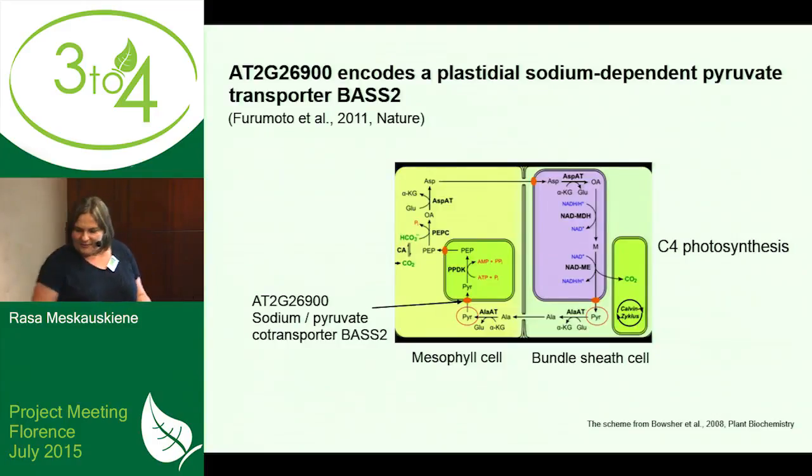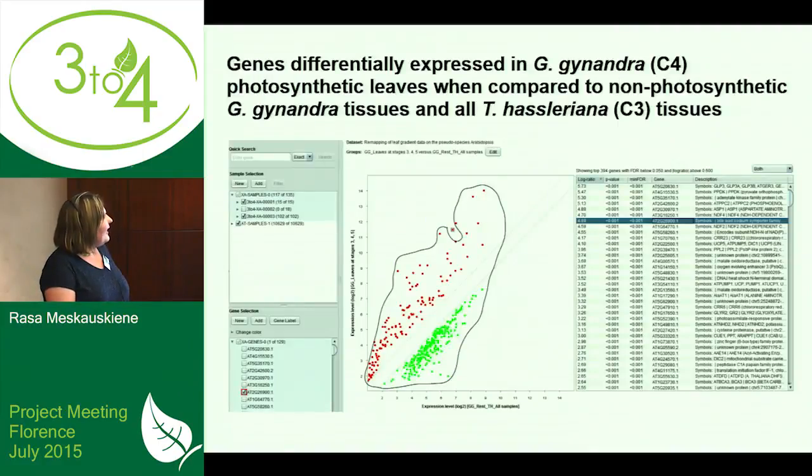And now it's actually up to you if you would like to do something more. So even in that one comparison, there were more genes, and I think one of those spots was this GNAT transcription factor somewhere. So maybe one could compare that list to Andreas' list or something like that. And of course, you can always open GeneVestigator and define your own comparisons, whatever you like. And we are constantly adding new experiments. So there is a good chance maybe to find something more interesting.